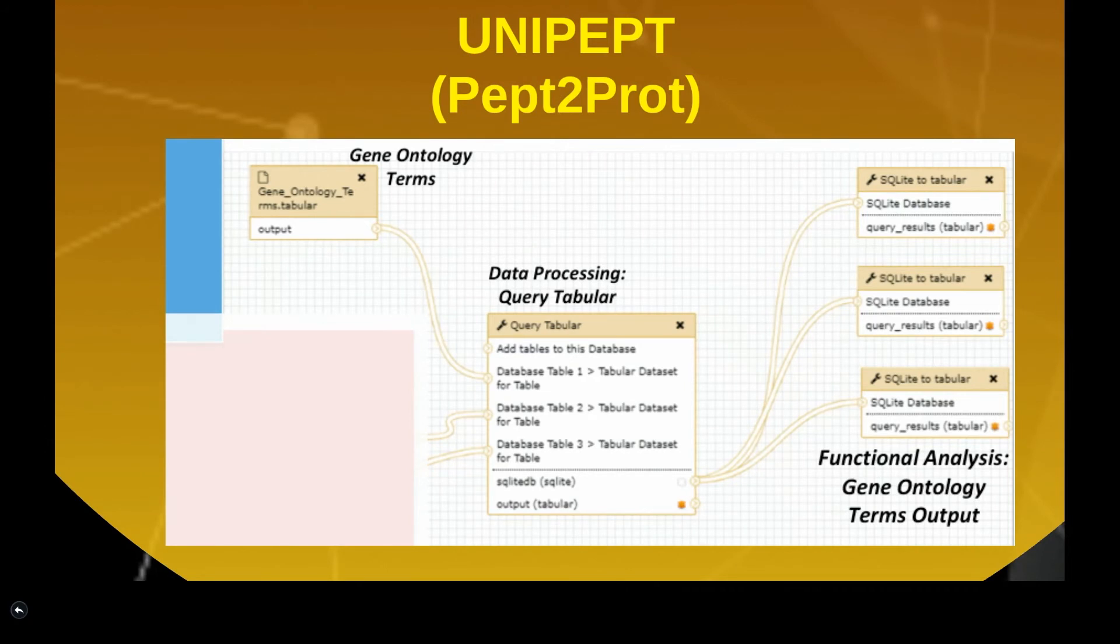The proteins are then mapped to gene ontology or GO terms, which can be used for biological interpretation.